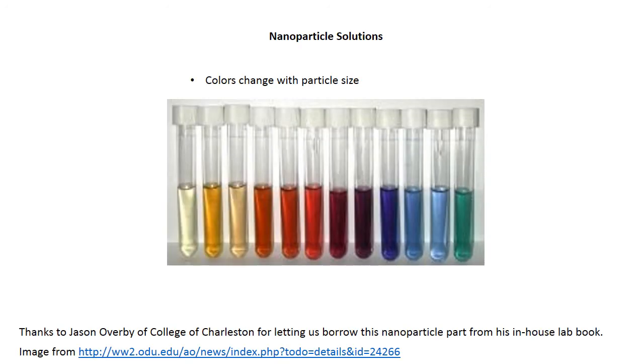And the last part, nanoparticle solution. These are interesting solutions because in this image here, which I took from the internet somewhere, what you find out is these are all the same solution, same compounds in here. The difference is they have different sizes. The particles are different sizes. And it's not until we get down to this very small, this nano size, 10 to the minus 9th or so, that we start seeing differences in colors based on the sizes of the particles. So we'll explore that a little bit with 3 known solutions and make up another one and play with that and see if we can measure something about the absorbance based on that particle size.